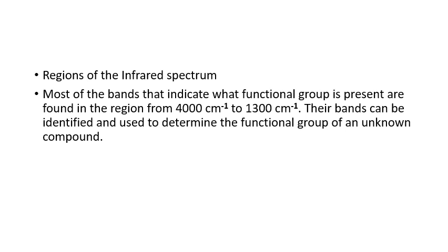The main attraction of this spectroscopy is that we must know the regions of the infrared spectrum. Most of the bands that indicate what functional group is present are found in 4000 to 1300 centimeter inverse.